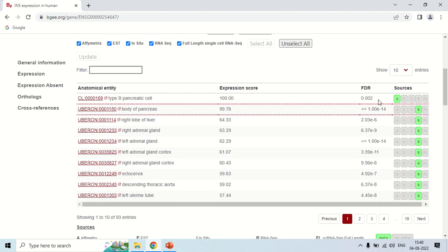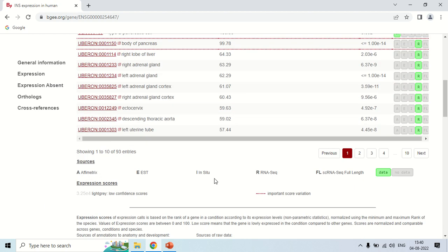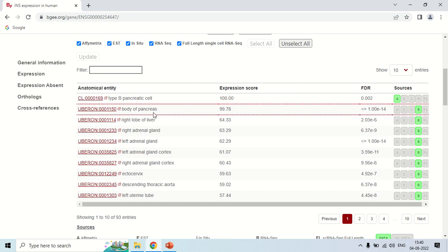The first data is from the FE-matrix. The second one — body of pancreas — shows the expression of this insulin gene in the body of the pancreas; the expression score is 99.78 out of 100, so it is very highly expressed and the source of this data is RNA-SKU. Similarly, for the third one — right lobe of liver — the expression level is lower at 64.33 out of 100. The score closer to 100 means greater expression of the gene.